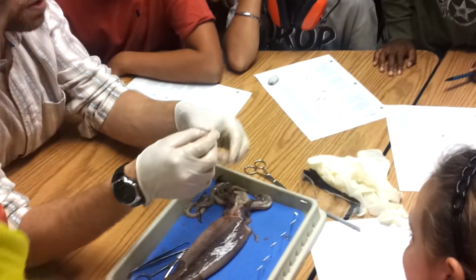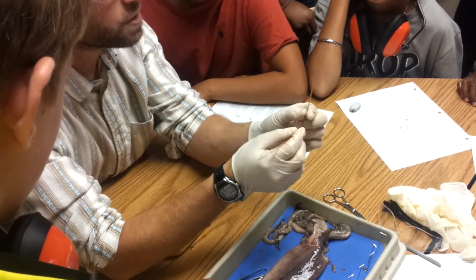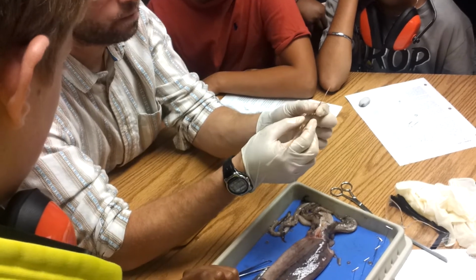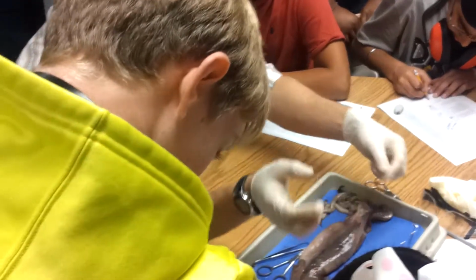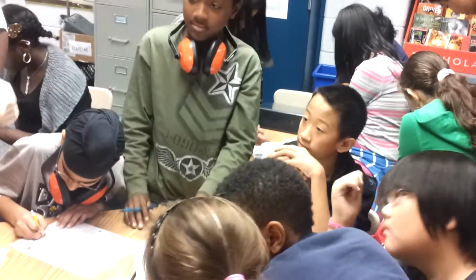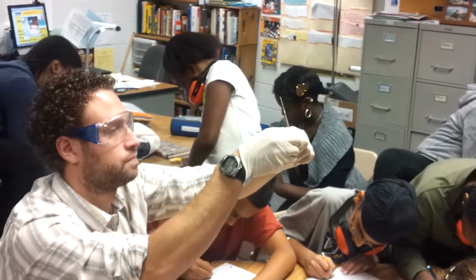That's awesome. So it's sort of flexible, but a little bit rigid, so it gives it some strength. It can still swim, but it gives it some support. And this is what's left of it, when it was a creature with a shell. Now he's much more floppy. There's the pen. We'll put that off to the side for now. Please draw a picture of the pen. Notice it's sort of clear, without any blood on it.